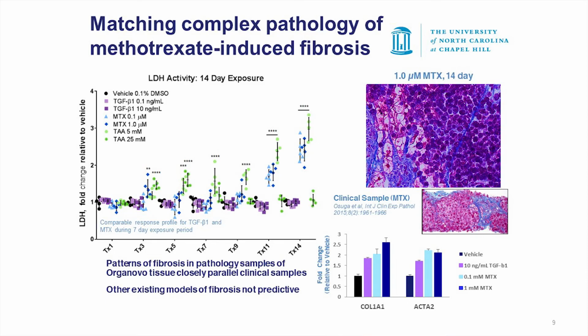And they're switching because their liver biopsy shows that, in many cases, they switch. There's a number of reasons, but one is that you'll start to see the liver fibrosis form. So back to the context of using an in vitro model to predict this, the University of North Carolina, working with Organovo's platform, did methotrexate exposure studies and showed a very nice pattern of liver fibrosis is replicated in the tissue. And so this is a disease model then.